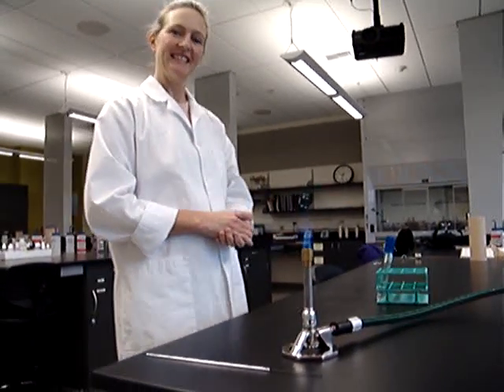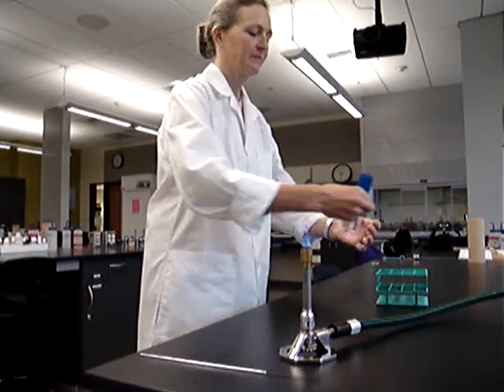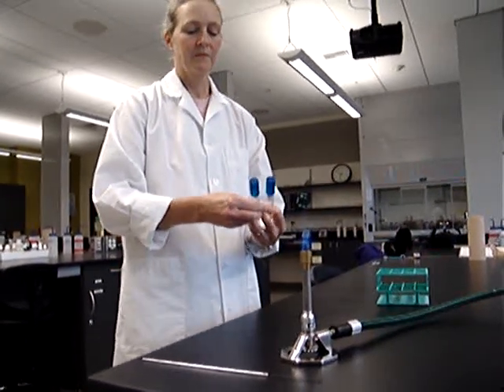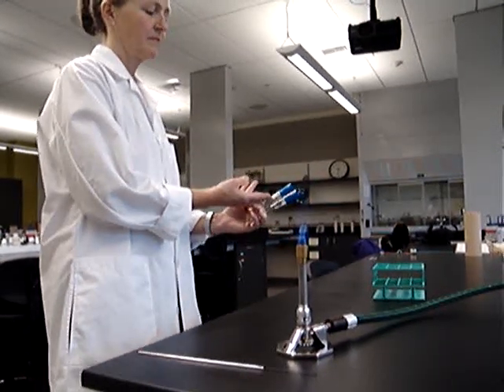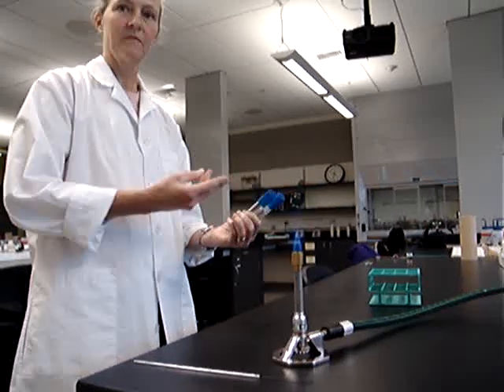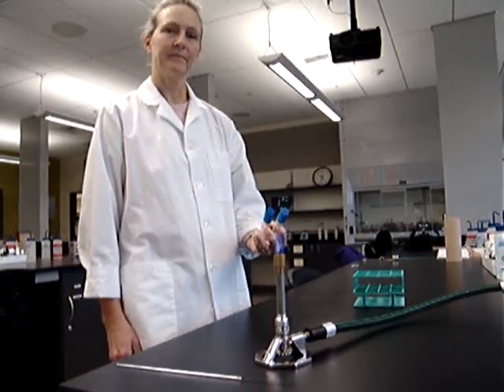Okay, Kerti, go ahead and pick up your tubes. Kerti is going to place them in her hands at a 45-degree angle — in the left hand she has her culture, and the right is the inoculating medium.